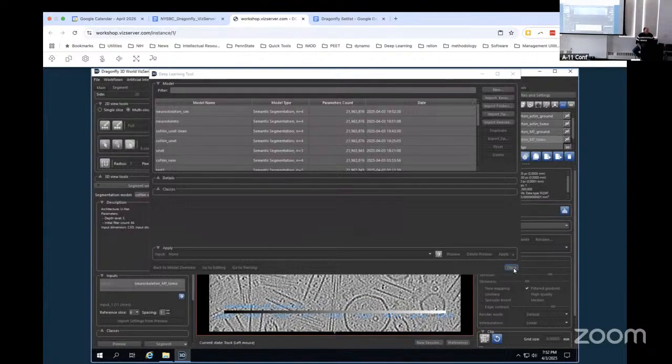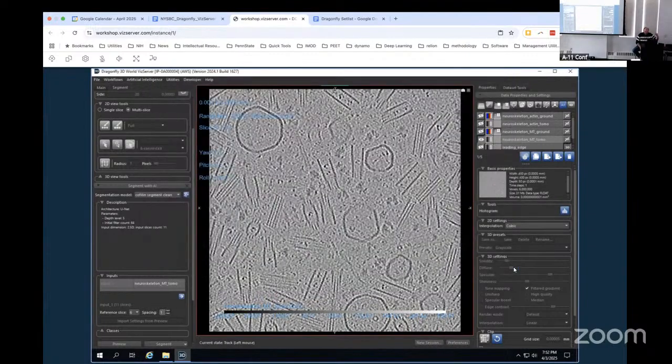And just hit open. So that imports that trained network into the system for us. I'm going to pick it, or you can select it too. You should have a network in your segmentation model drop down now called Neuroskeleton Sim. Does everyone see that? All right. And I'm just going to hit segment.